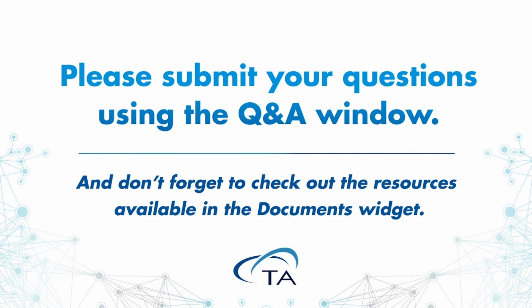The DSC is just one technique to look for interaction. And the fact is, if you find interaction, you're most likely going to want to do chemical analysis. And so you're not likely going to just use DSC. It's just one of several tools that you're going to need to determine if interaction is occurring. Again, I think the DSC gives us that rapid screening technique to determine is there likely interaction or likely no interaction, and then that allows us to proceed on with other types of tests.